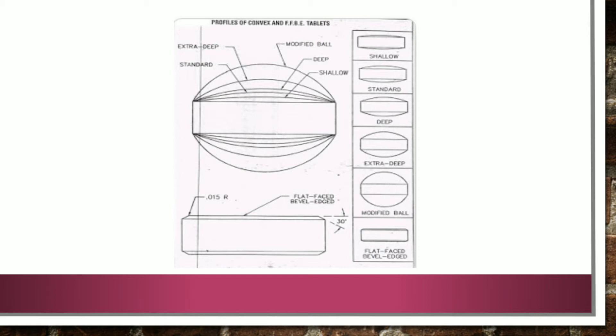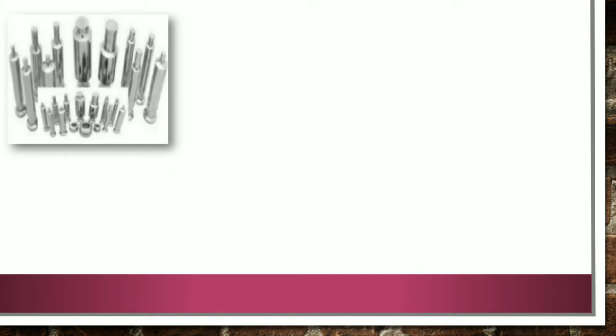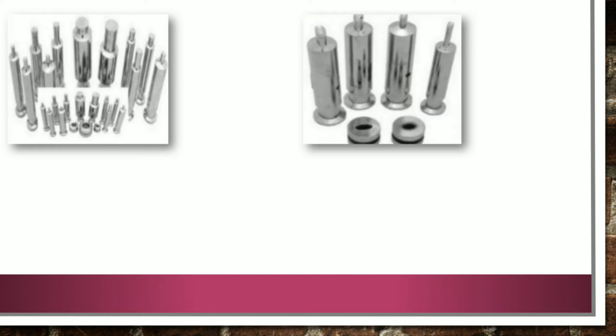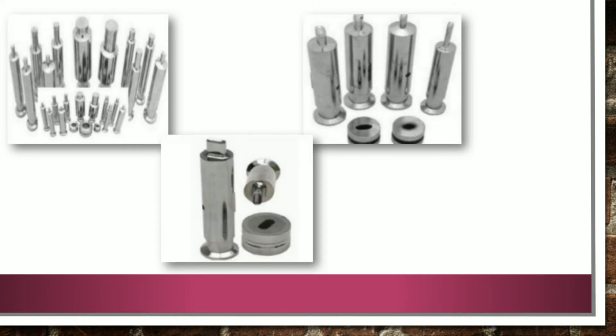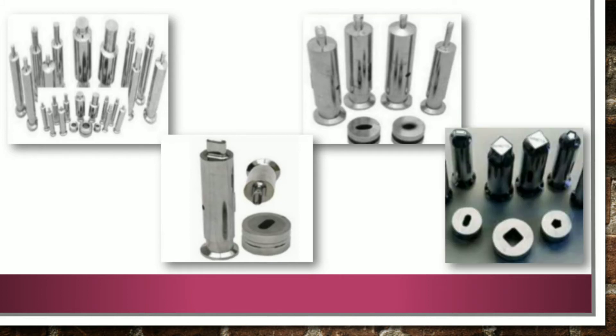Here you can see a round shaped punch die set, then an oval shaped punch die set, then a capsule shaped punch die set, and the last one is a geometric shaped die set. All these are applicable to pharmaceutical as well as ayurvedic industries for manufacturing tablets of different sizes and shapes.